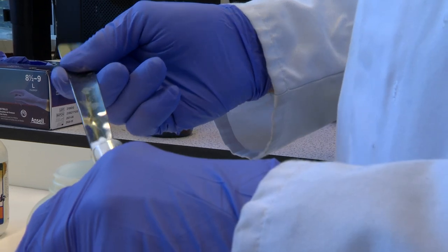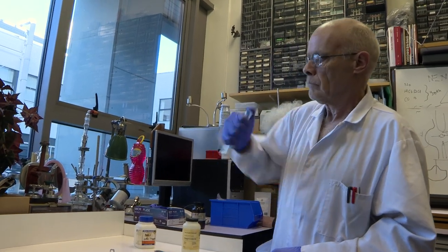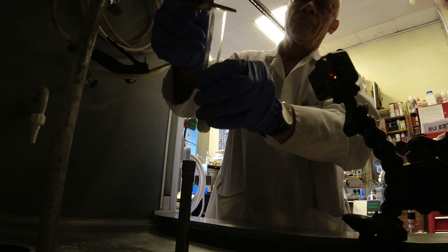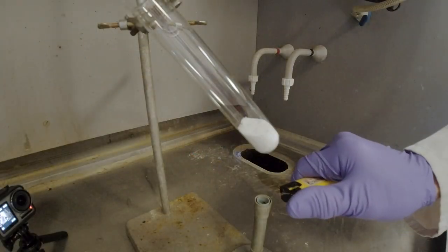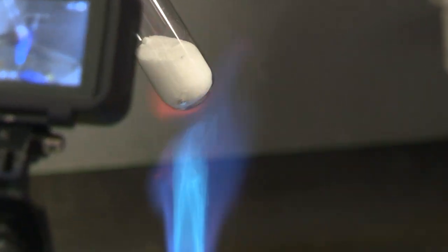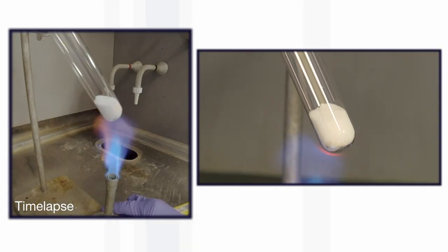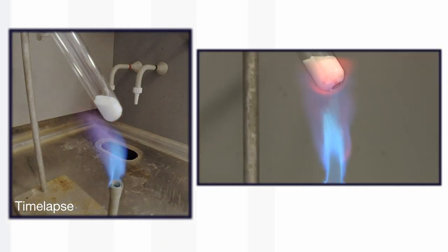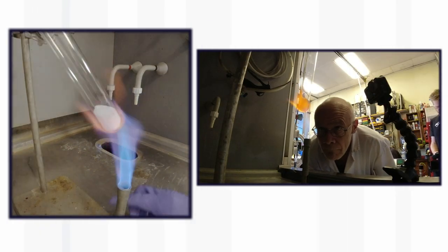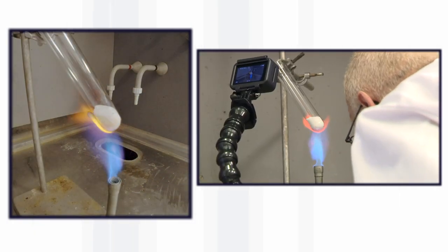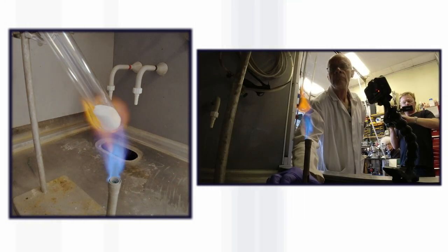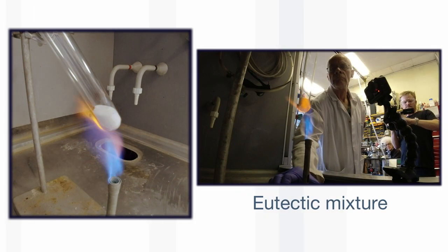This in itself is quite difficult because the melting point of sodium chloride is higher than the melting point of a test tube. However, if you mix it with potassium chloride, you get a mixture which melts at a lower temperature than either pure sodium chloride or pure potassium chloride. It's a so-called eutectic mixture.